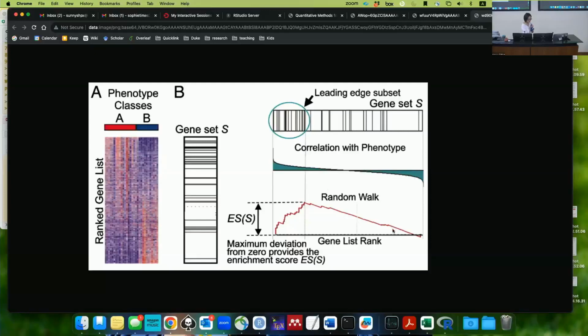So when it's negative, the step size is dependent on the size of this. They don't step down, they step up just less often, right? They step down when you run into a gene that's not in the gene set, so they do step down here. Right, but this is a gene set that's on, right? It doesn't have a negative effect on this. It doesn't step them down, it still steps up, just less than the gene. I didn't know about the statistic that changes the size of the step. I thought it was literally just based on ranking the genes and from there getting an effect.